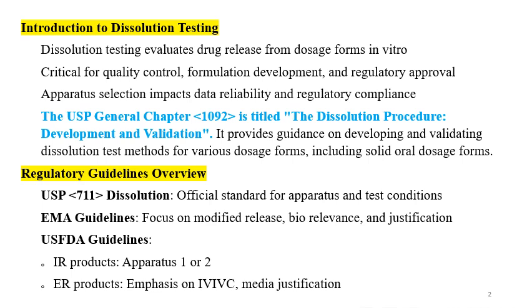Dissolution testing is a test which evaluates the drug release from the dosage forms. Dissolution testing is an in vitro test, and it is a performance test for the formulation. It provides valuable information about the in vivo behavior of the formulation. Dissolution testing is a critical quality control tool, and it impacts the formulation development, regulatory approval, and the post-approval changes.